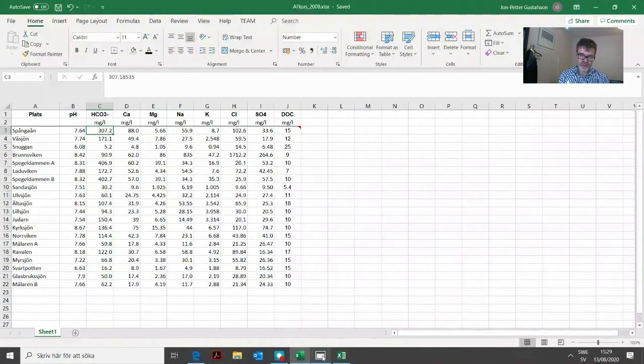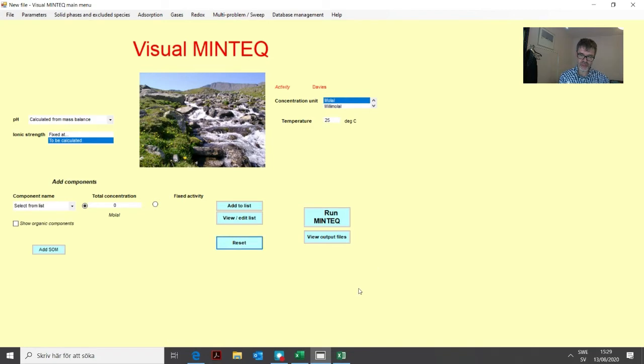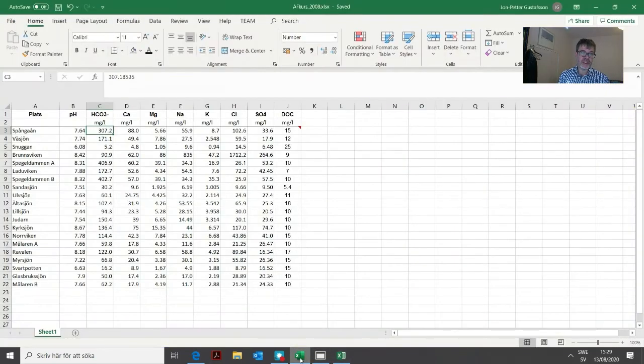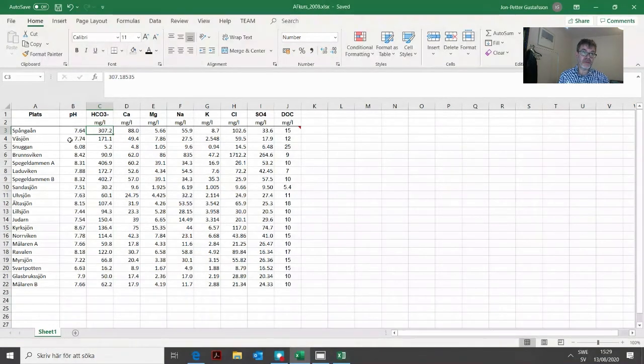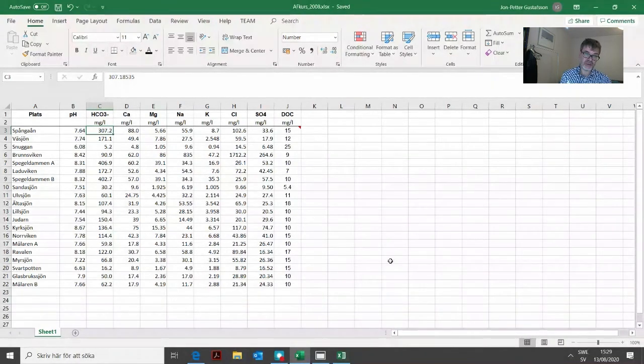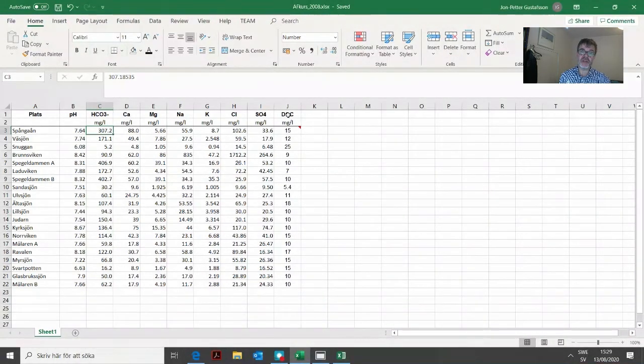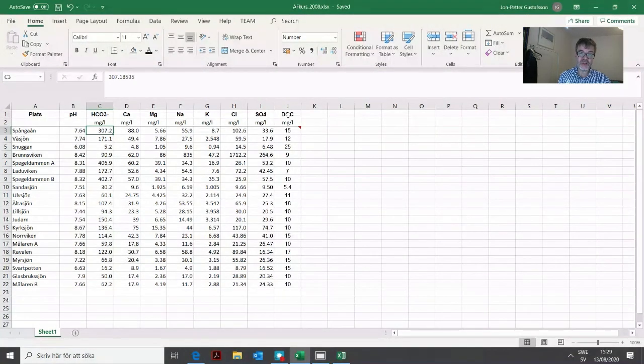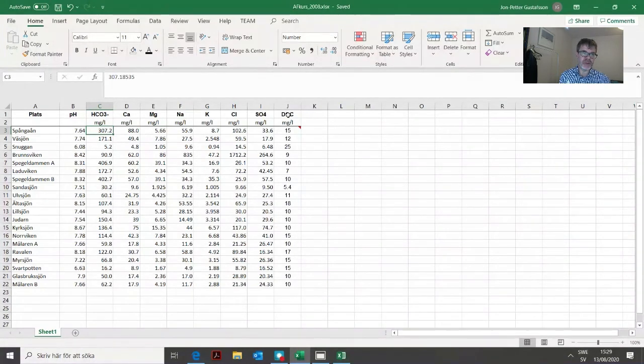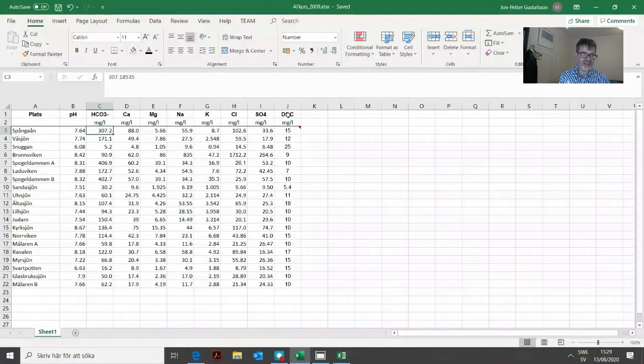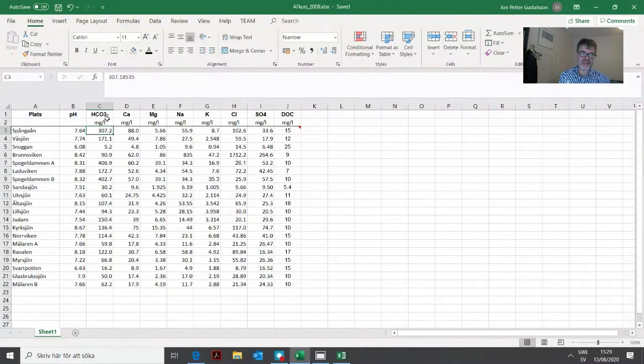We need to import these to Visual MinTeq. We go to the multi-problem generator, but before we do that, we click reset. One thing to think about is if there is any model we need to define before we try to import things. There is, because in this case we have DOC. The program needs to know what DOC model we have before we start importing. It doesn't need to know the alkalinity option, but we need to know the DOC option.